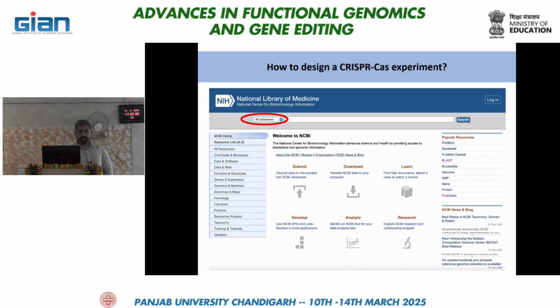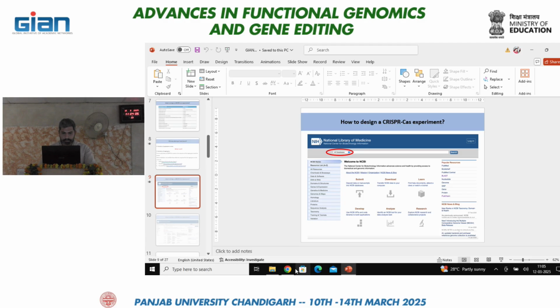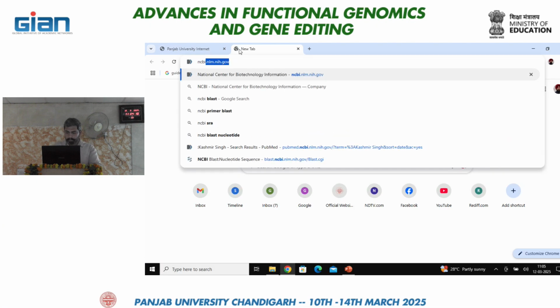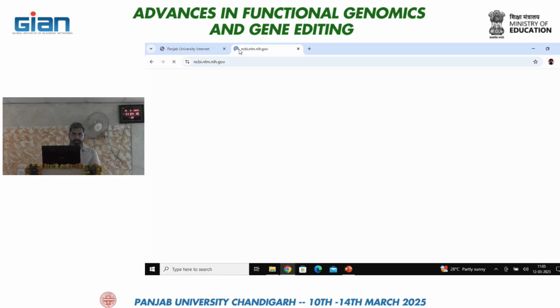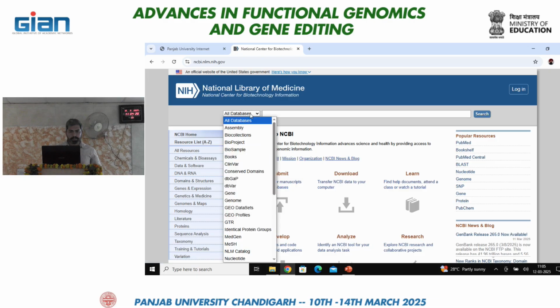Once you have opened this NCBI database, all must have opened it. You can select from this drop down, or I can open it simultaneously with you. Now from this drop down, instead of all databases, you have to select gene here.